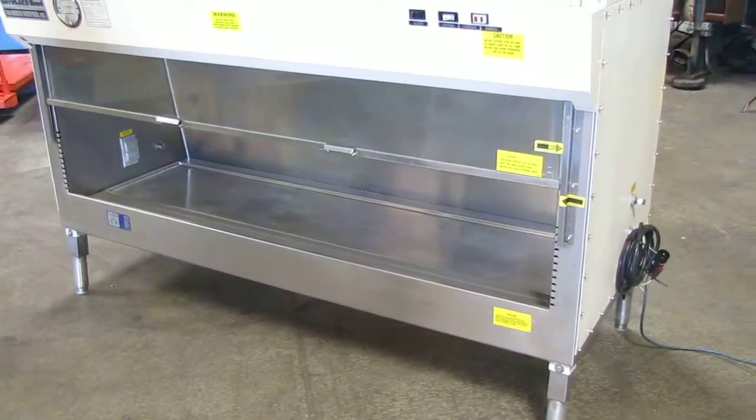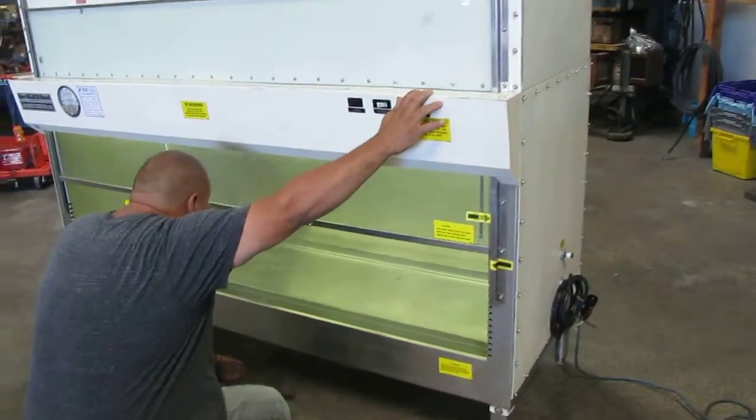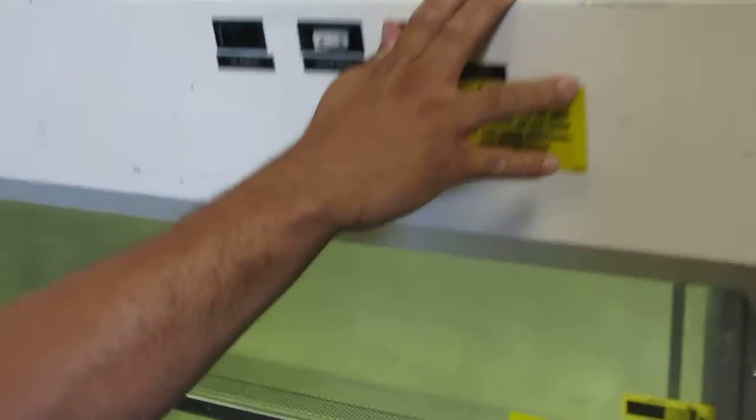Next thing we'll show you is the lights. If you can come down here, you can see your fluorescent light is right up on this side over here where my finger's pointed.